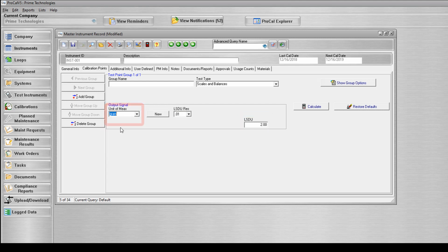As stated before, this test verifies the accuracy of a scale or balance. The test is configured by specifying the unit of measurement and accuracy of the device being tested and setting the limits for the various tests. Collection of the calibration data involves three tests on the device: a zero check, a repeatability test, and a corner shift check. All tests must pass for the calibration to be considered successful.